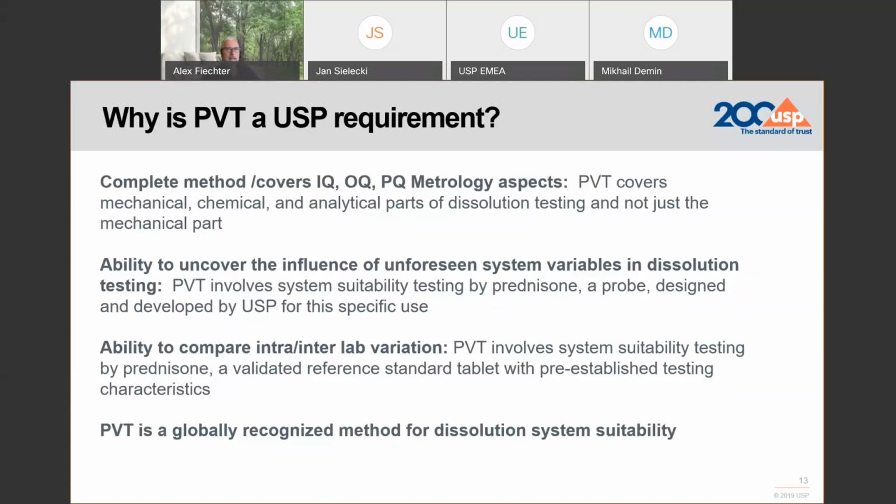PVT is a globally recognized method for dissolution systems. The US Pharmacopoeia is the only pharmacopoeia that describes a specific formulation with specific test procedures. Other pharmacopoeias do recommend a similar system suitability approach, but you are left with your own interpretation of what to do with PVT.